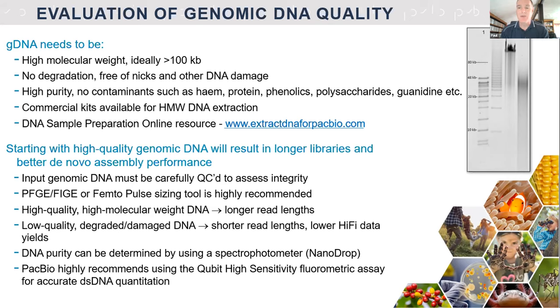Though you can perhaps work with it, it's not going to be ideal for your application here for whole genome sequencing. So you want high molecular weight DNA, you want your DNA free of degradation, free of nicks and other DNA damage, okay? It also needs to be clean, so highly pure. Classic problems that we see from blood extractions are carryover of heme, so we want to avoid that. We don't want any proteins or polysaccharides that can commonly come from your cellular debris. We don't want that in the sample.